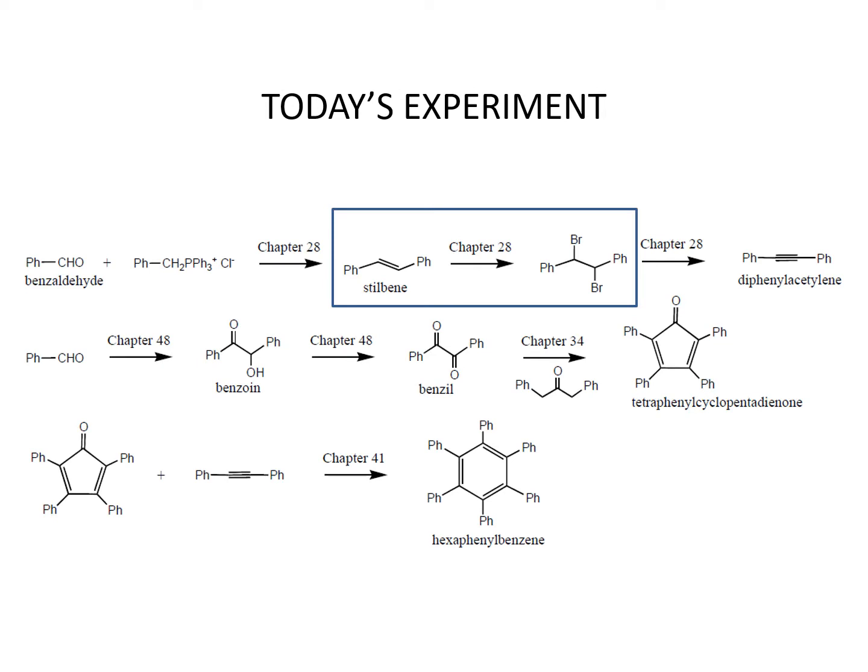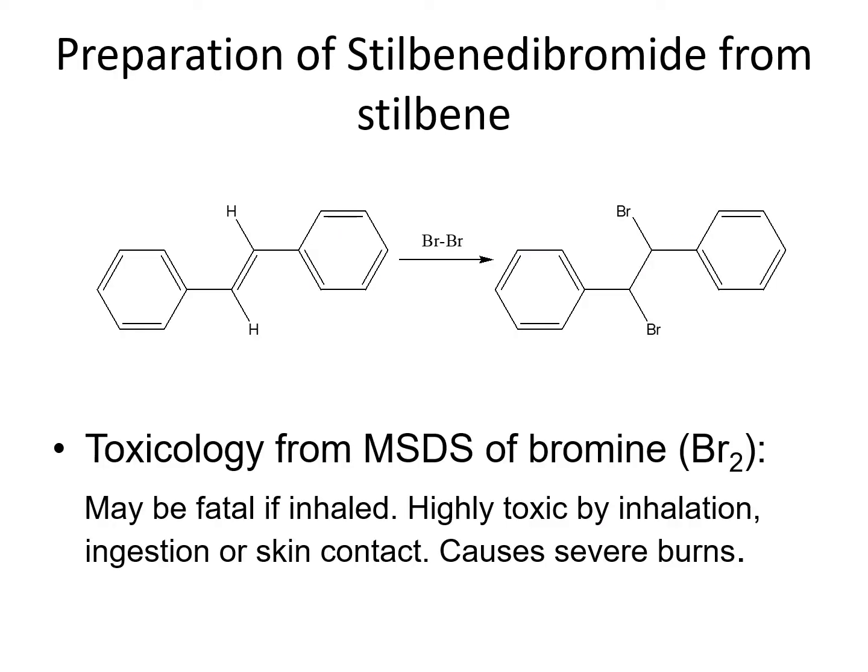And so the contribution we would like to make for this whole reaction is by providing a dibromostilbene, and we can synthesize dibromostilbene from stilbene by adding a bromine molecule. So the way the bromine adds is that two bromine atoms will add into the double bond to saturate the double bond, and then you will have a saturated bond with two bromines in it.